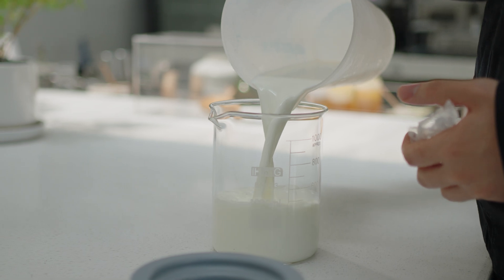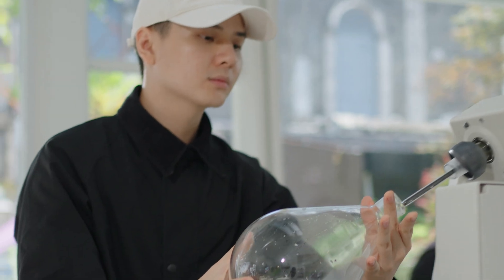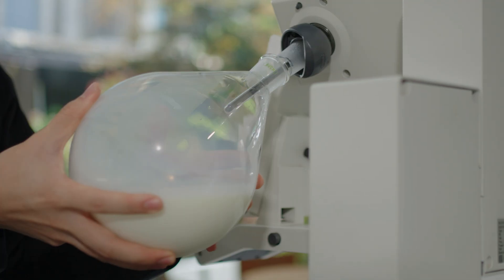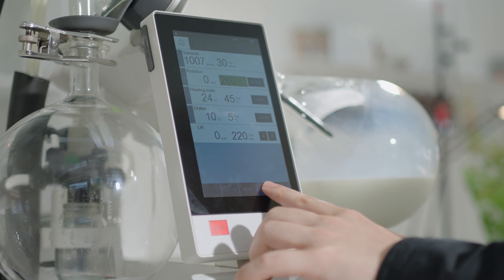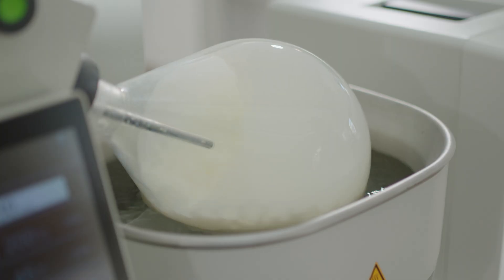Because freeze distilled milk takes a longer time to prepare and cannot be stored for too long, another creative way of preparing this milk is using the rotary evaporator. The rotary evaporator aims to evaporate the water in the milk rather than having the milk thaw out slowly, which is what happens in the conventional way. Heat is introduced to the milk at one end, causing water to evaporate and then condense at the receiving end. By lowering the vacuum level, we decrease the boiling point of the milk without damaging its structure.